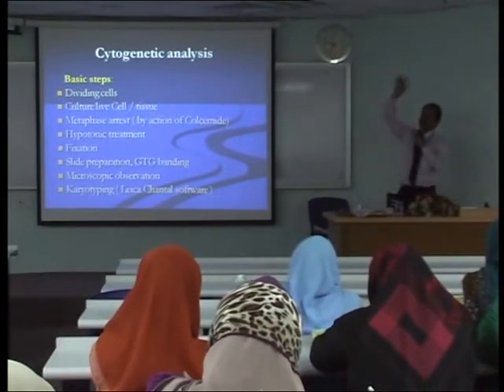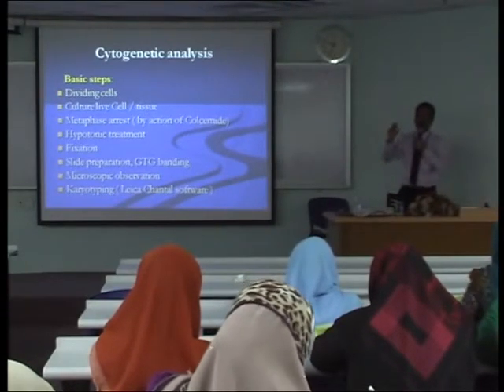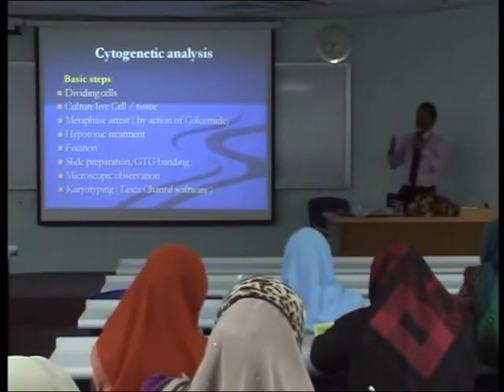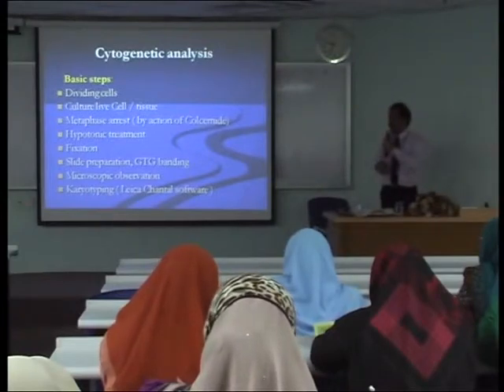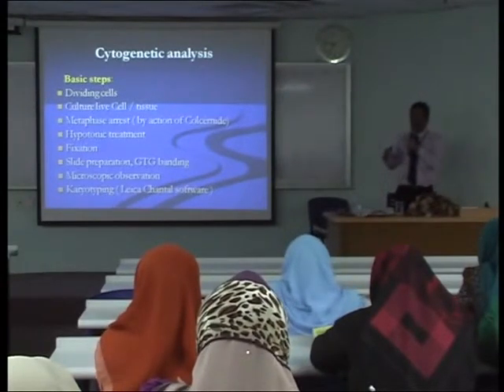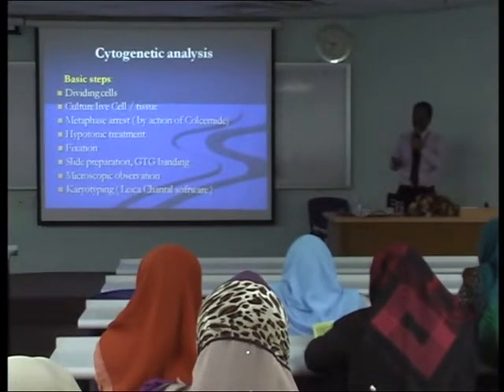If the height is too high, the chromosomes will be overspread. If the height is too short, the chromosomes will be underspread. So that will affect counting the chromosome number and like that. Then after preparing the slides, we have to dry them and then do the staining.